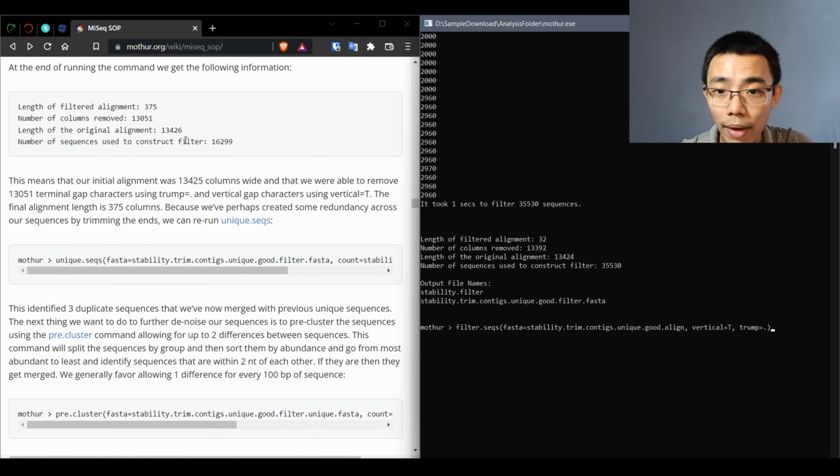Okay, so once we've done that, we can now search for, finally, the chimera. For those who have never heard of this word before, a chimera sequence is a sequence that is not natively there, but rather a new contig that is joined from two different biological genes. So this gene and this gene got broken off somewhere during the isolation process, and they actually got joined together right before or during the sequencing process, so that it results in a new gene that doesn't exist.